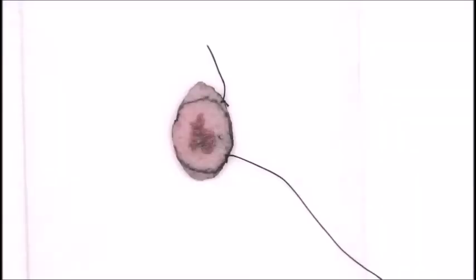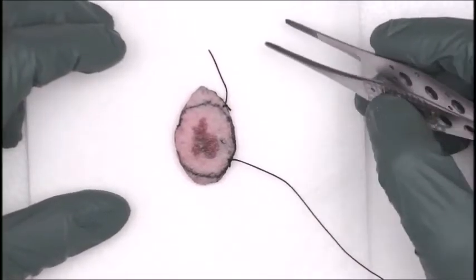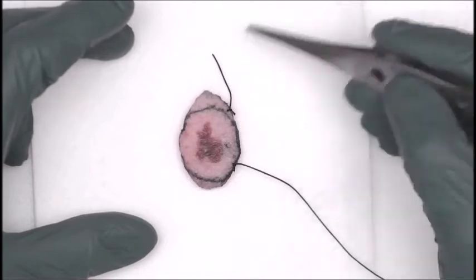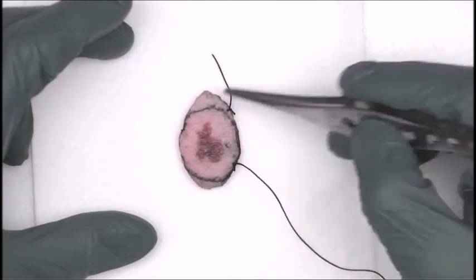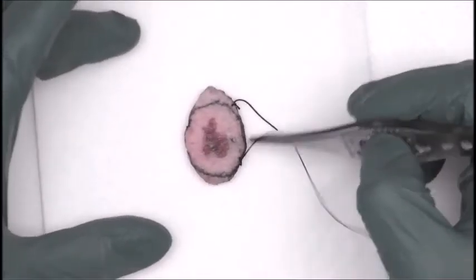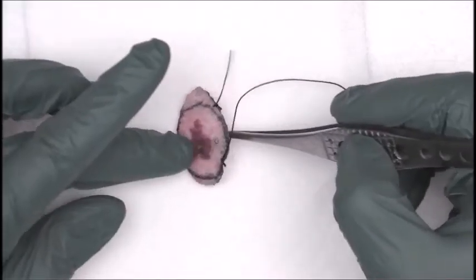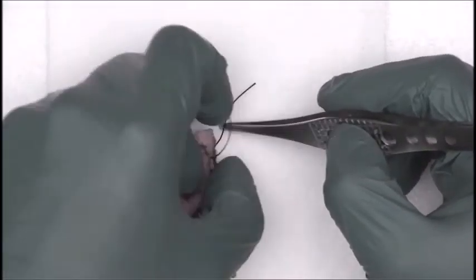All right, so now coming back to the skin ellipse. As far as inking goes, there's a variety of ways of inking these skin ellipses. The way we do it is, after we've done our designation of what the sutures are, the 12 o'clock to 6 o'clock peripheral skin soft tissue margin is inked one color, okay? The 6 to 12 o'clock peripheral skin soft tissue margin is inked another color, and then we'll do the deep aspect one other color, okay? That's one way of doing it. It kind of depends on the way your practice works.